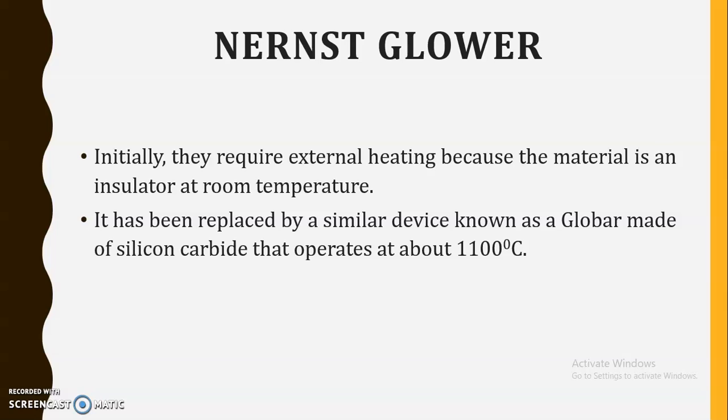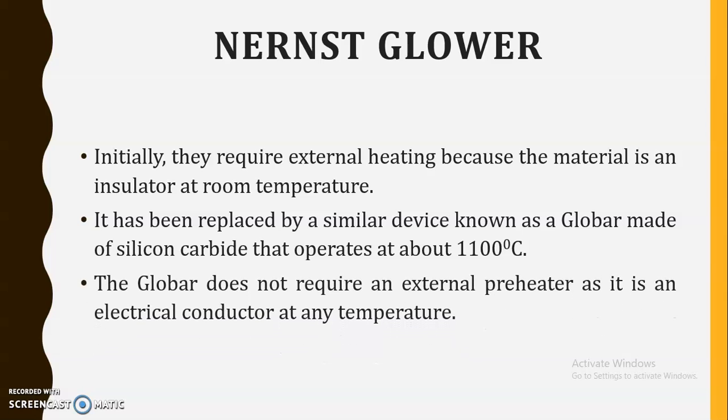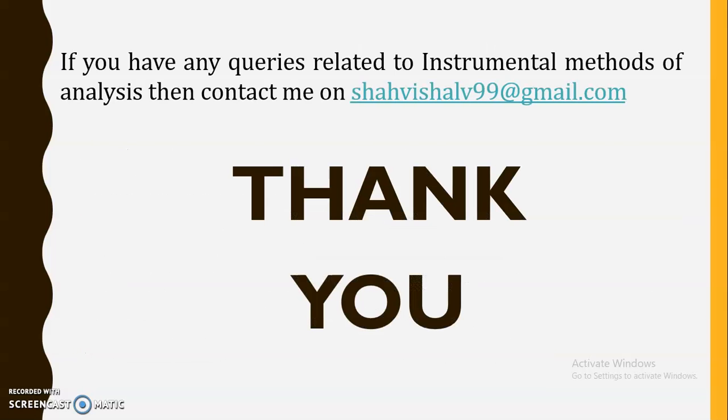It has been replaced by similar devices known as the Globar source, made of silicon carbide, that operates at about 1100 degrees Celsius. It is better suited for an evacuated system.